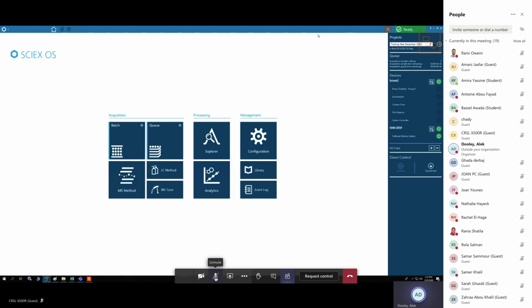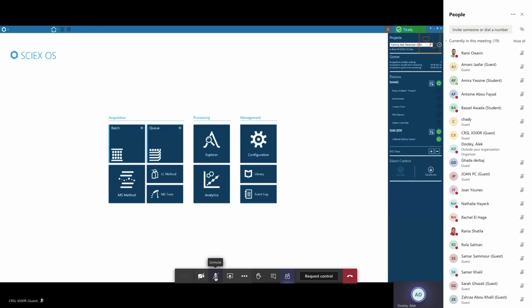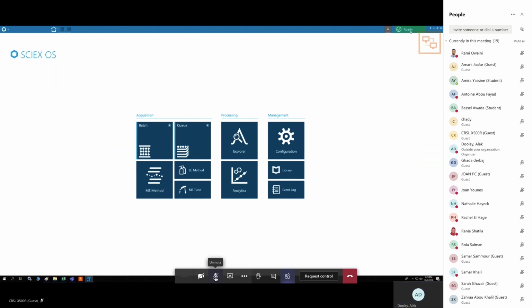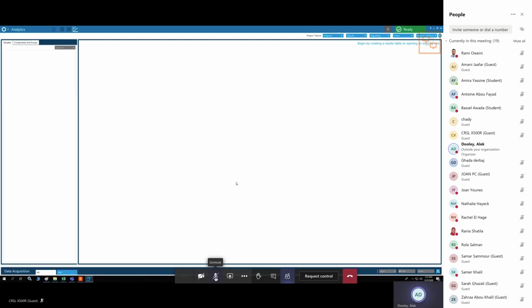What happened? Did I lose control? Are you guys still there? Yes, we're here, but I guess the PC is processing. Yeah. There we go. Okay, we're back.